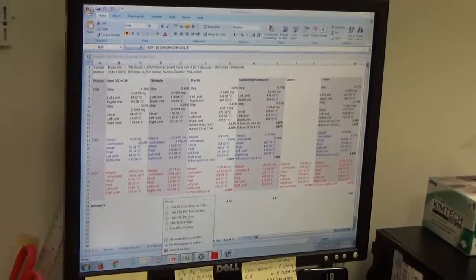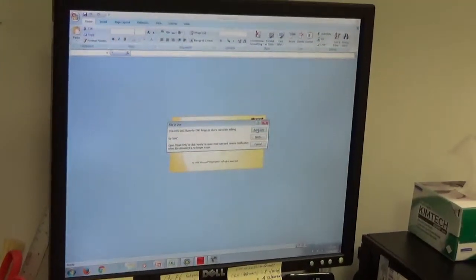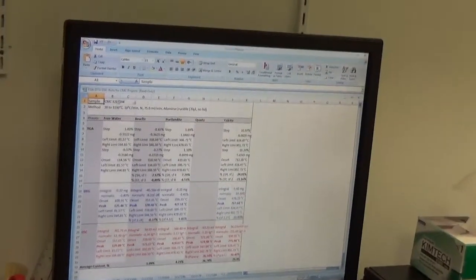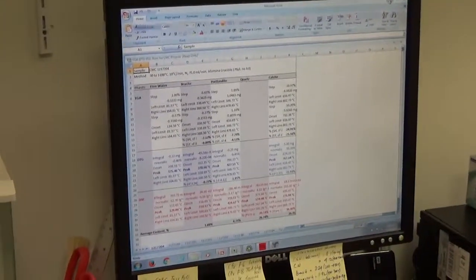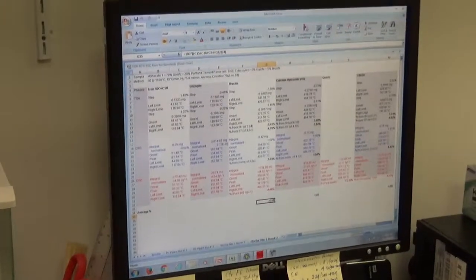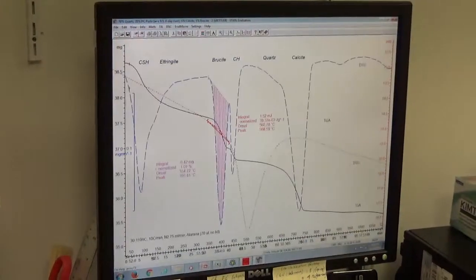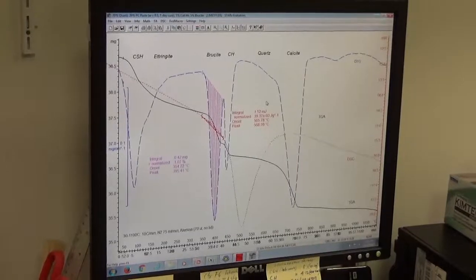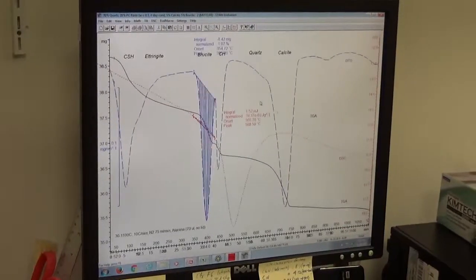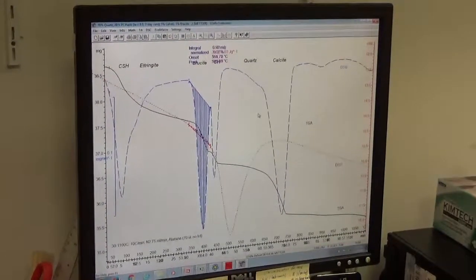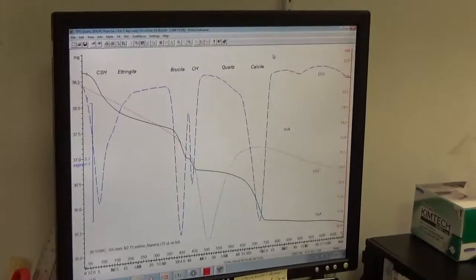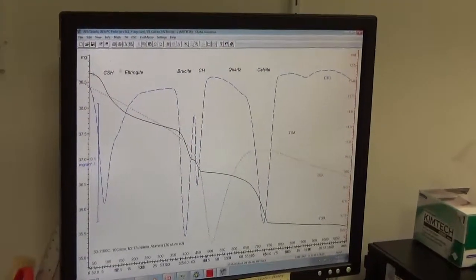That's how the data is calculated in Excel. We calculate the data, then copy and paste into a PowerPoint presentation. That's how the data is shown in the evaluation screen of the Mettler Toledo STARe software.